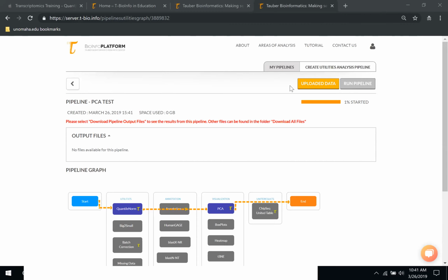Okay, if you're going to do the RNA-seq pipeline and get an RSAM expression table, there would for sure be some kind of expression, because if there is zero expression, it doesn't make sense to do the study. There might be low expression, but there would be some expression.